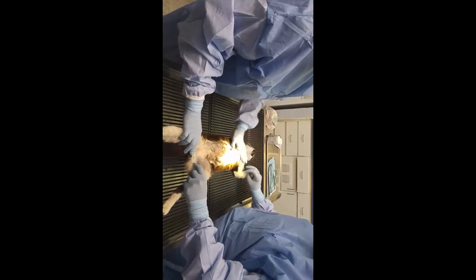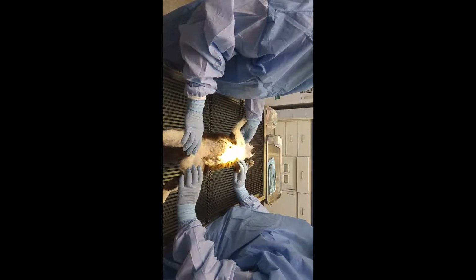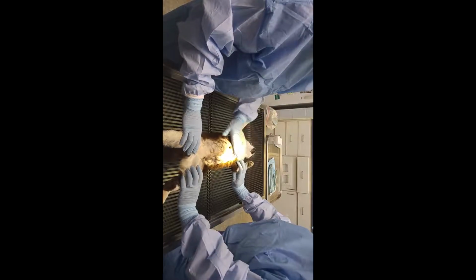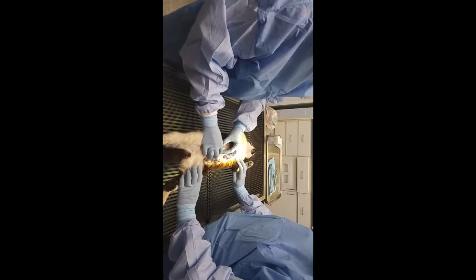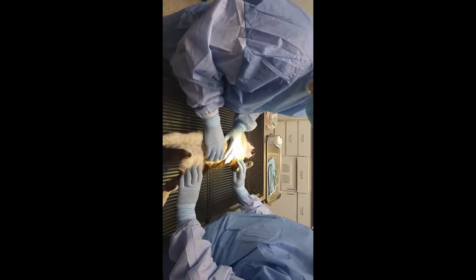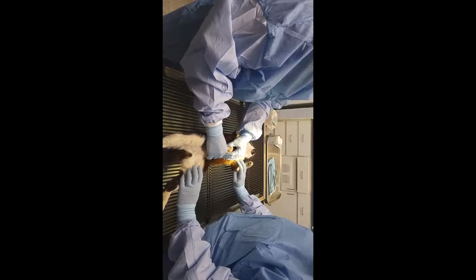Okay, we have this kitty. Jessica's already shaved and has her prepared for the necropsy. This animal was actually obtained from our local shelter. All we know is that she was a feral kitty. And just on gross inspection of her skin, we can see that her teats are engorged, and she does have some milk that is coming from them. So I suspect that she had a recent litter, or is currently pregnant.